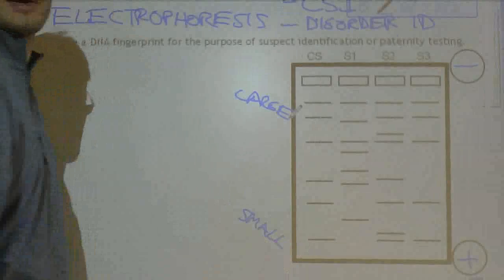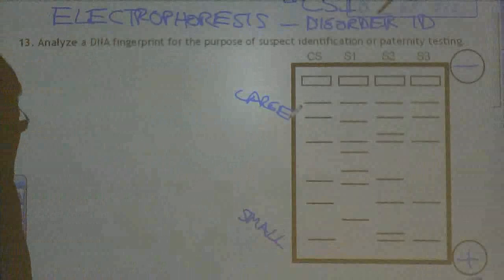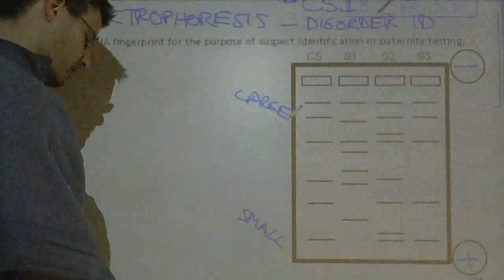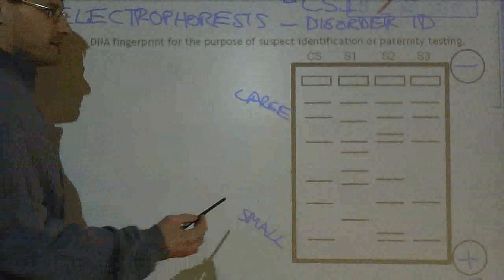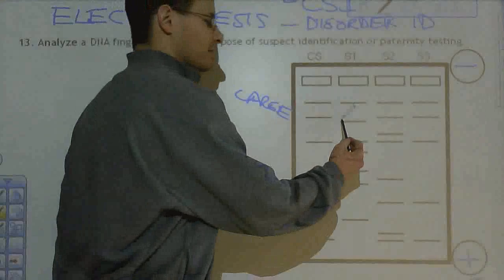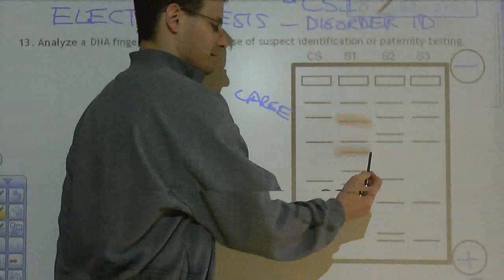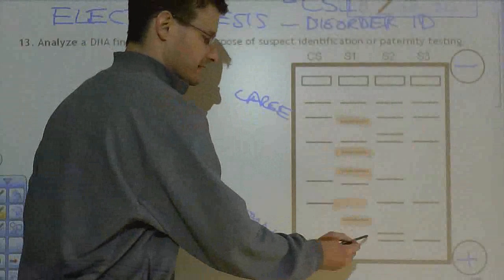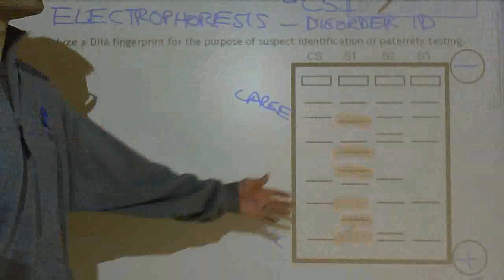Every single one of these bands here in the crime scene you want to match up to one, hopefully guilty, party. So when we go through this and analyze it correctly, we notice that this band doesn't match up, this band doesn't match up correctly. There's missing bands here and too many bands in other cases. So right away we know this suspect is not guilty.